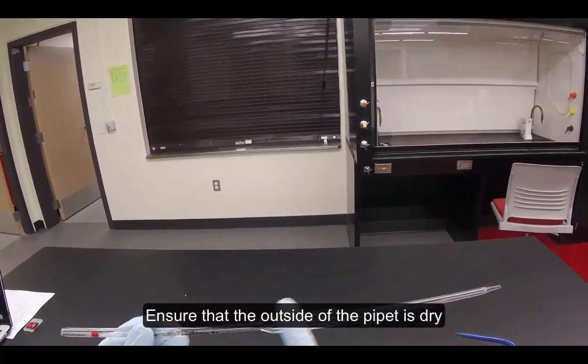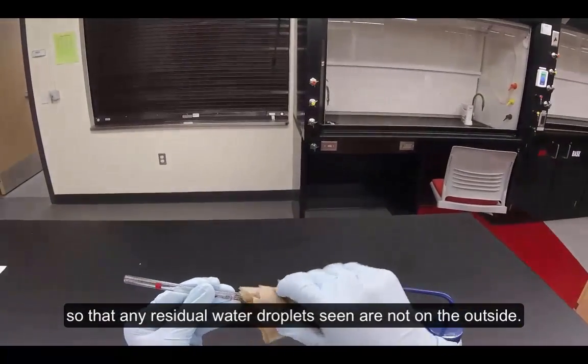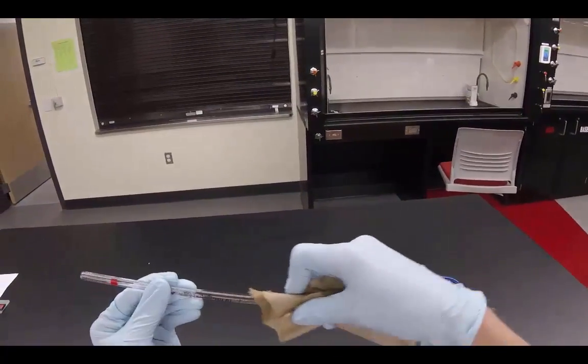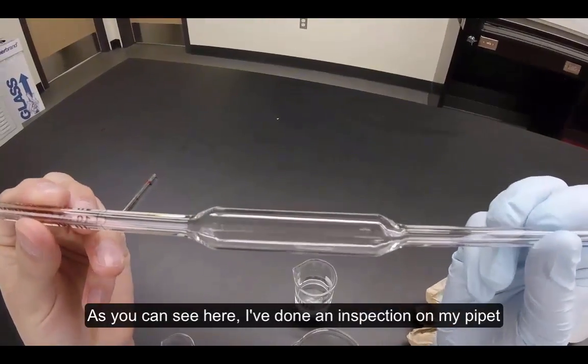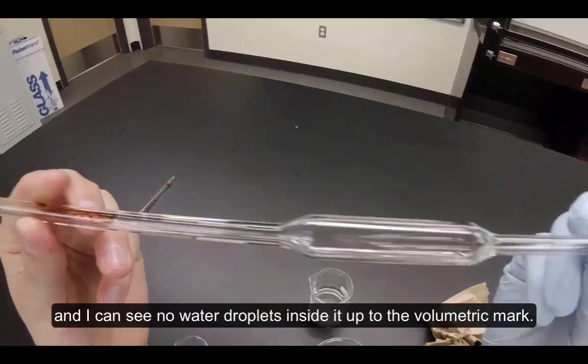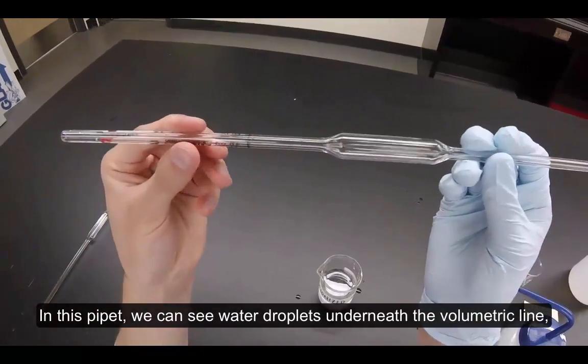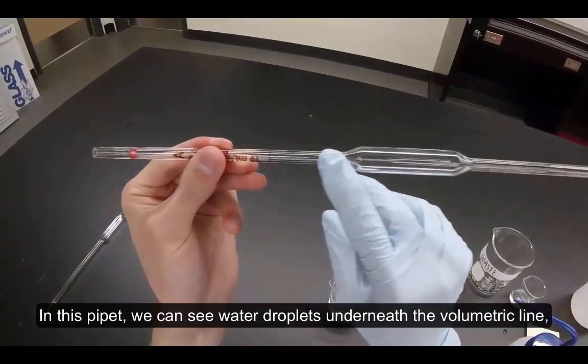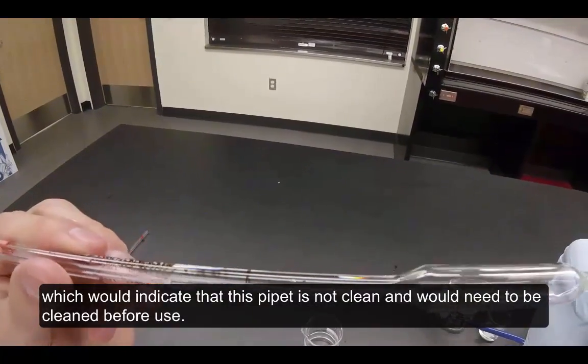Ensure that the outside of the pipette is dry so that any residual water droplets seen are not on the outside. As you can see here, I've done an inspection on my pipette and I can see no water droplets inside of it up to the volumetric mark. In this pipette, we can see water droplets underneath the volumetric line, which would indicate that this pipette is not clean and would need to be cleaned before use.